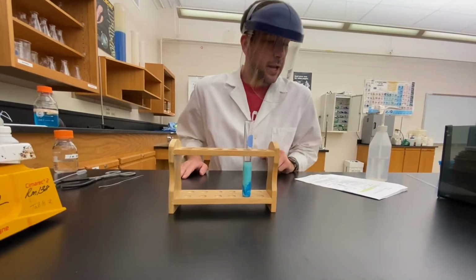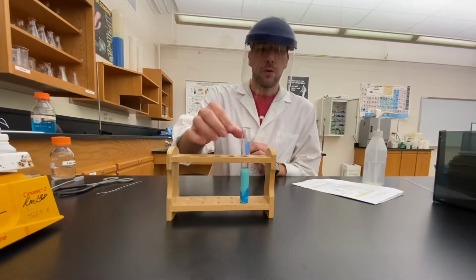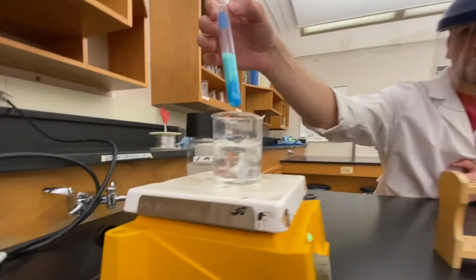For the second reaction, we're going to place this test tube into our hot water bath, and we're going to observe.